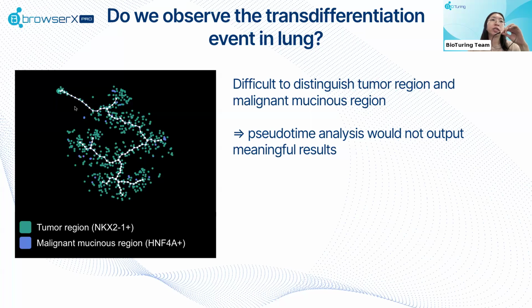If you were to see a more clear separation of these two regions, then maybe you'll be able to interpret the results more meaningfully. Again, just to reiterate, it was really difficult to distinguish between these two tumor regions and the malignant mucinous region, and so performing pseudotime analysis didn't really output any meaningful results for me.